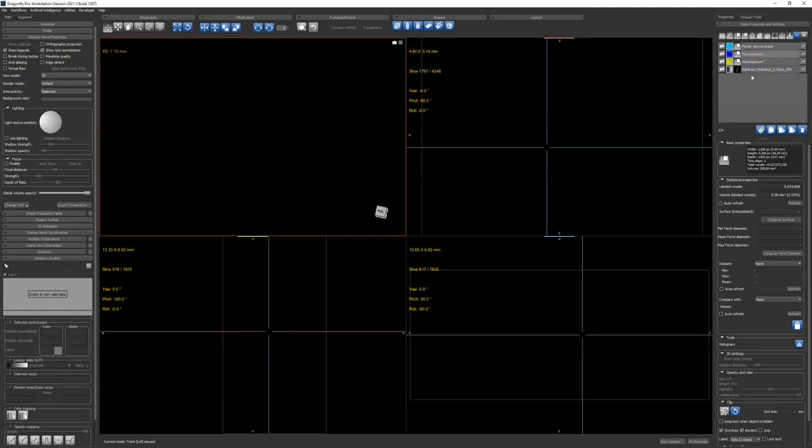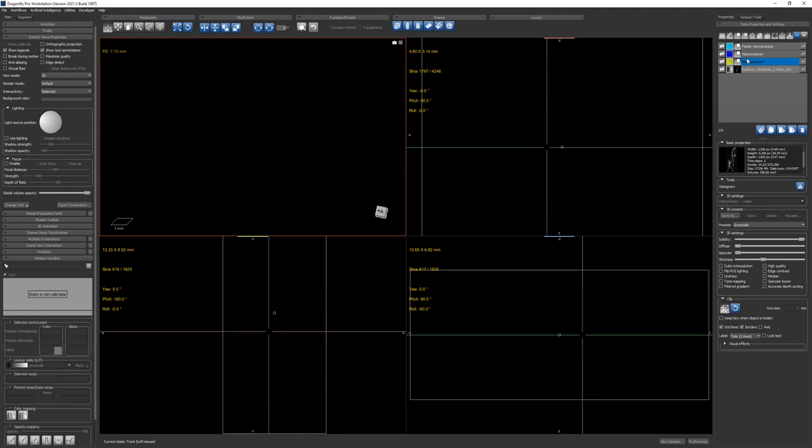So what else? In the end, if you finish a project, what you have from beginning to end is the raw data from the scanner. You have your reconstruction or stitch if you have multiple segments. And you have an ORS session with segmentations and TIF stacks. And that's kind of what you have. You can save.